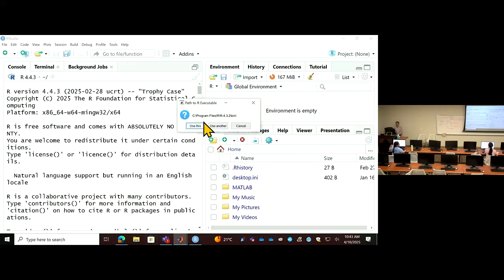Yeah, so from looking at this, currently my MATLAB is pointed to the wrong version of R. If you can see this clearly, this is R 4.3.2. Well, the one I installed Harmony in is a different version.